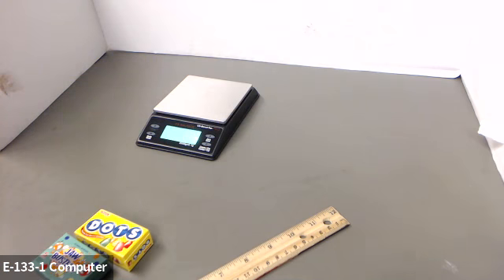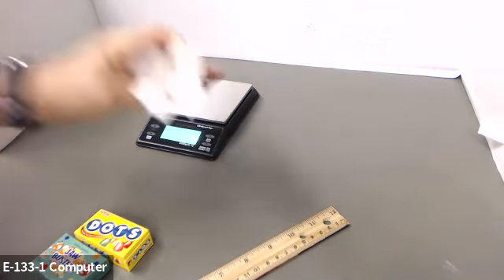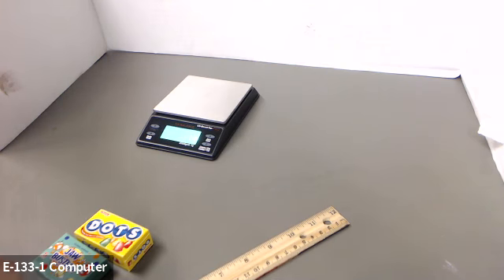You can eat the candies after you've taken the first initial mass. Then you're going to make sure that the boxes are empty and put them back on the balance. This one is empty. Milk duds is 2.1 grams. Okay, that's good to know.